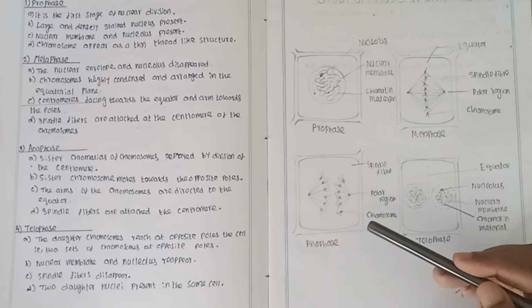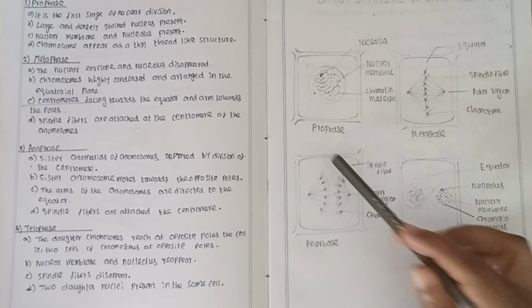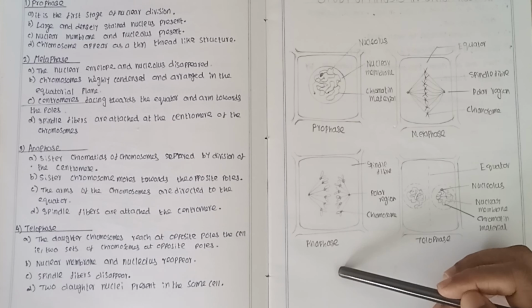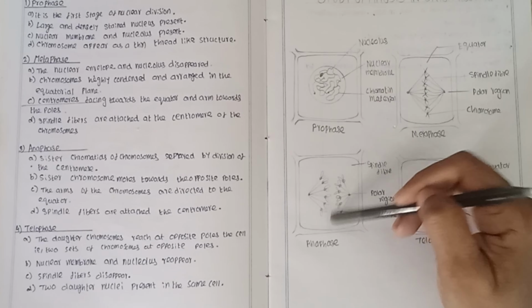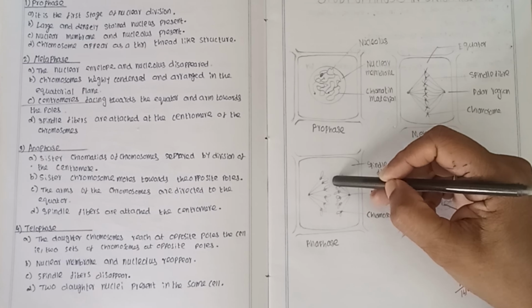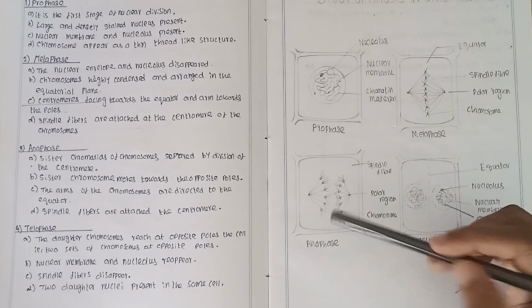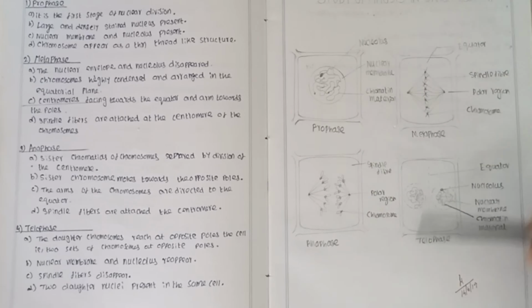Then cytokinesis begins at the late phase of anaphase. The cytoplasmic division starts. In a plant cell, a cell plate, the phragmoplast, starts to develop at the center portion of the cell.